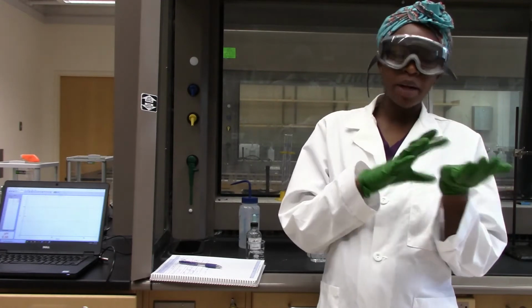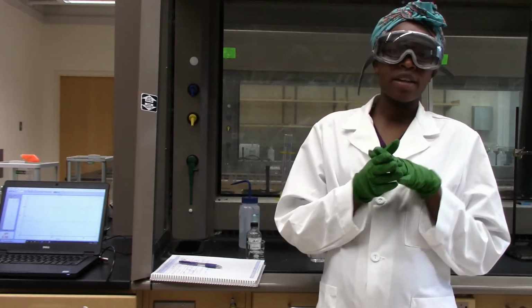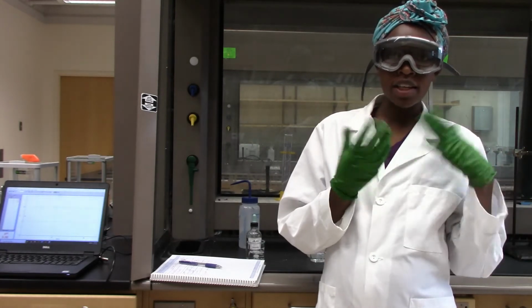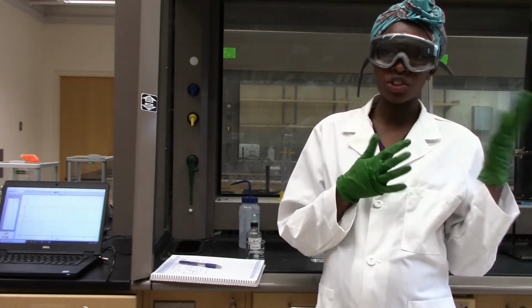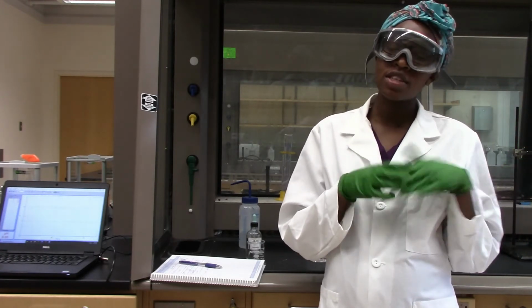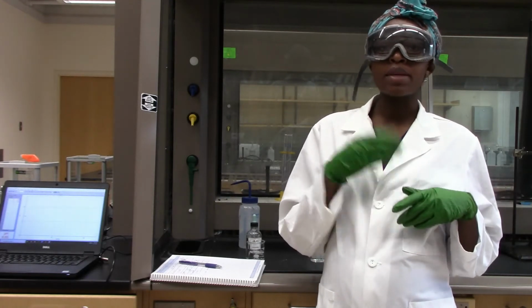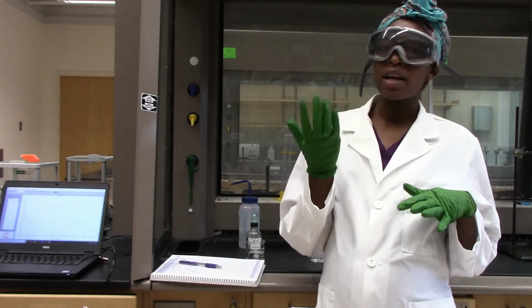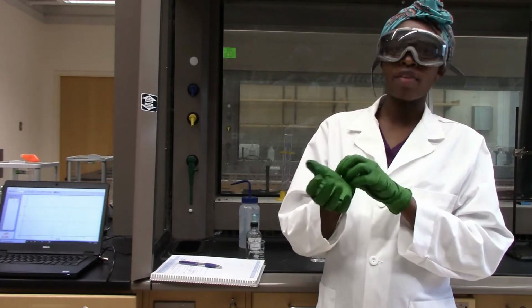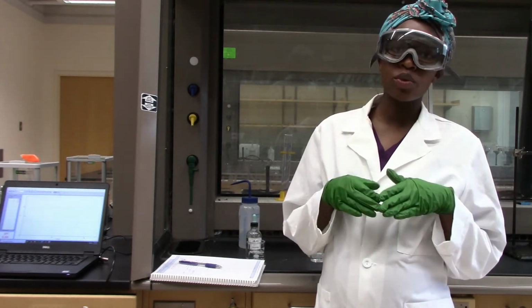Welcome to the experiments with acids, bases, and buffers. Acidity is basically a measure of the concentration of hydrogen ions. So you know that when you have a high concentration of hydrogen ions, then you have an acidic solution. And basicity will be the concentration of hydroxide anions. And buffers are substances that resist change in pH.